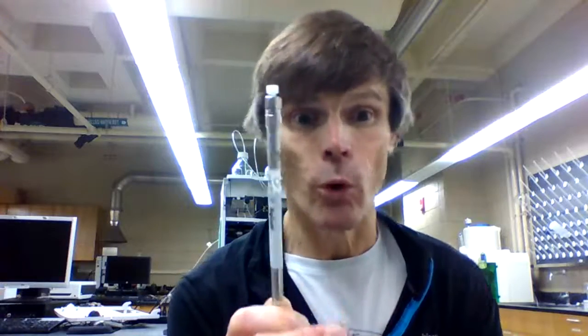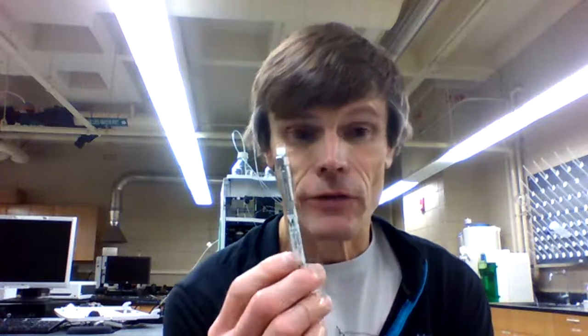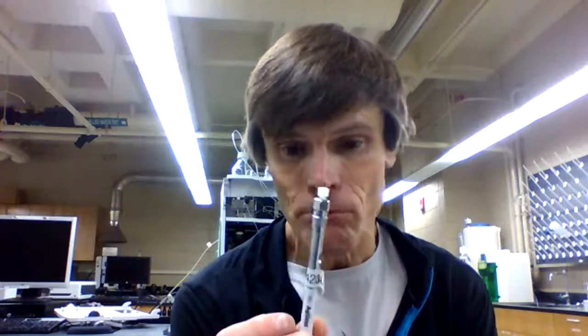or one that's polar. And like we said earlier, we use the mode of chromatography to help us communicate what we're trying to separate, what the column's composed of, what components we expect to come off first. Now, if we pack this with particles that had silanol groups like we showed earlier, that's going to be normal phase.